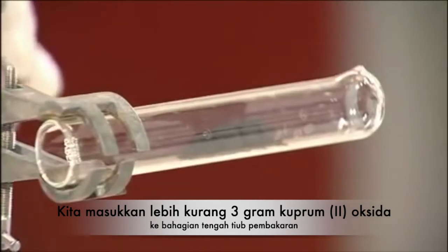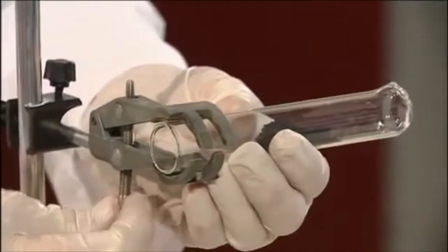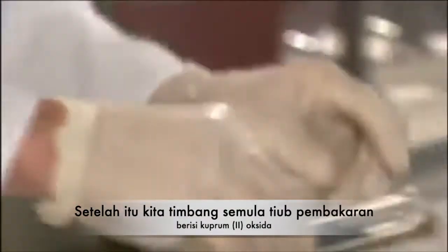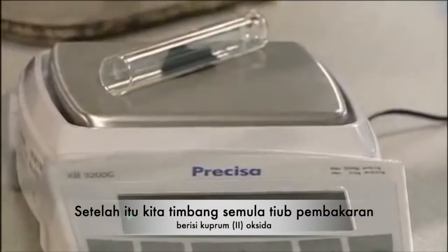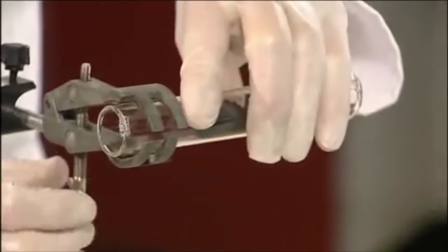Try to place this in the center of the tube. Having put the copper oxide into the tube, we reweigh it. The copper oxide should be dry. Old stock may need to be dried in an oven or desiccator.